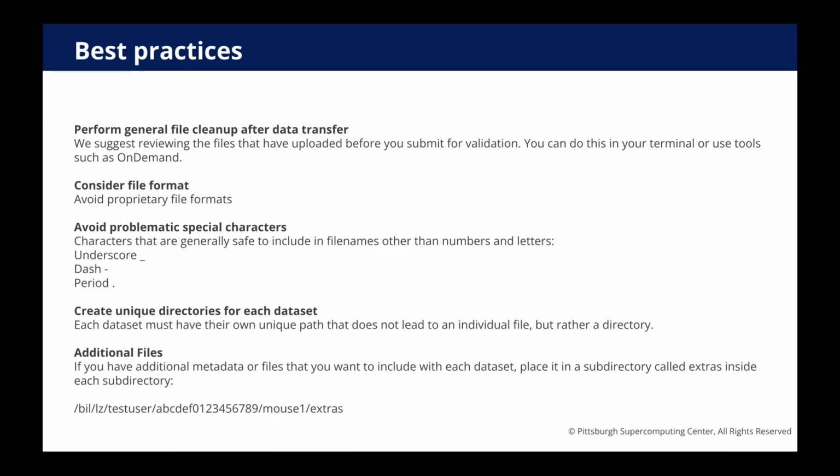And so the next point here is to create a unique directory for each data set. What's important for me as a data curator is truly that we are able to connect any piece of metadata that you upload to the exact directory that we're referring to. And so it's very clear that the connections between the metadata and the files that you upload, there is no room for interpretation there, or guessing as to what images this metadata is trying to describe. And so that is why you can have many data sets within a single submission. And all of these data sets have unique metadata entries.